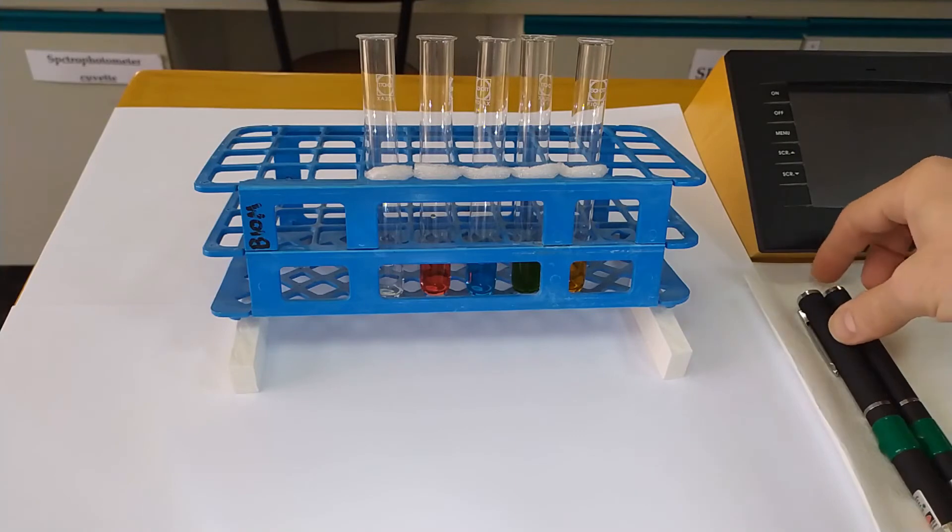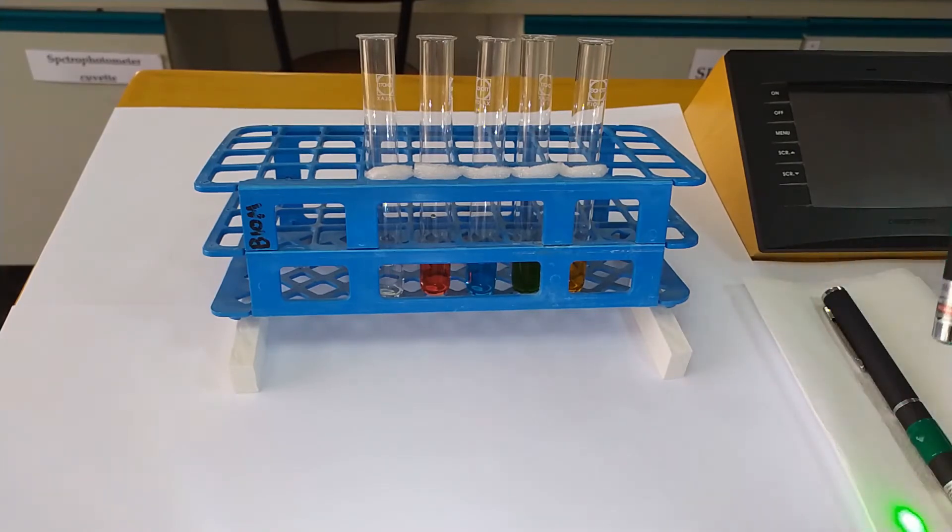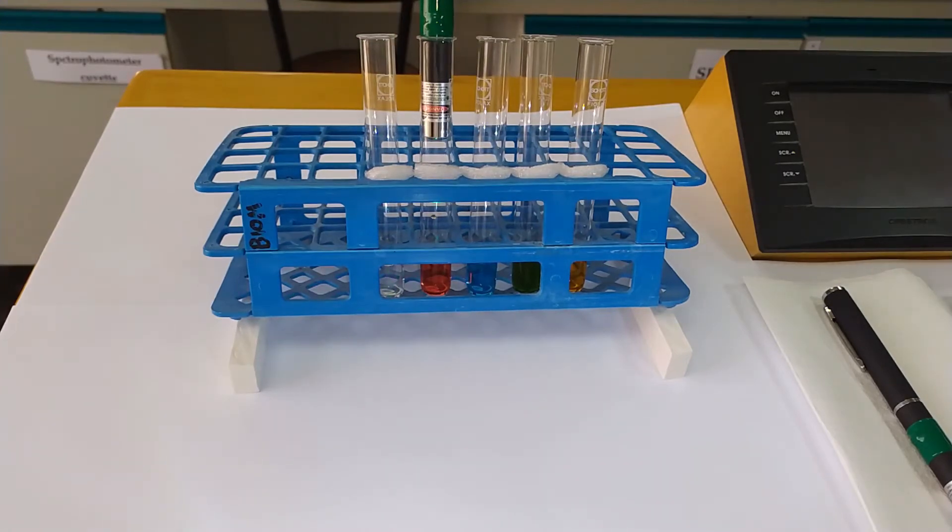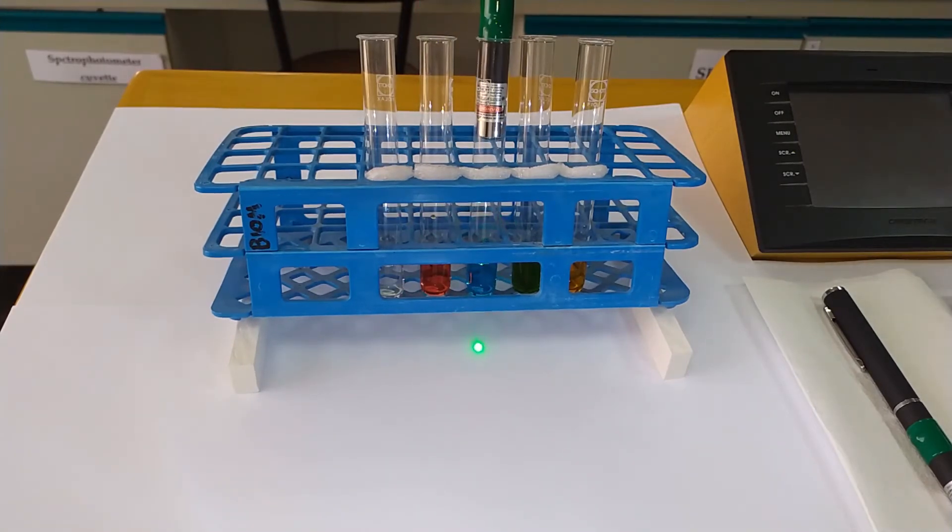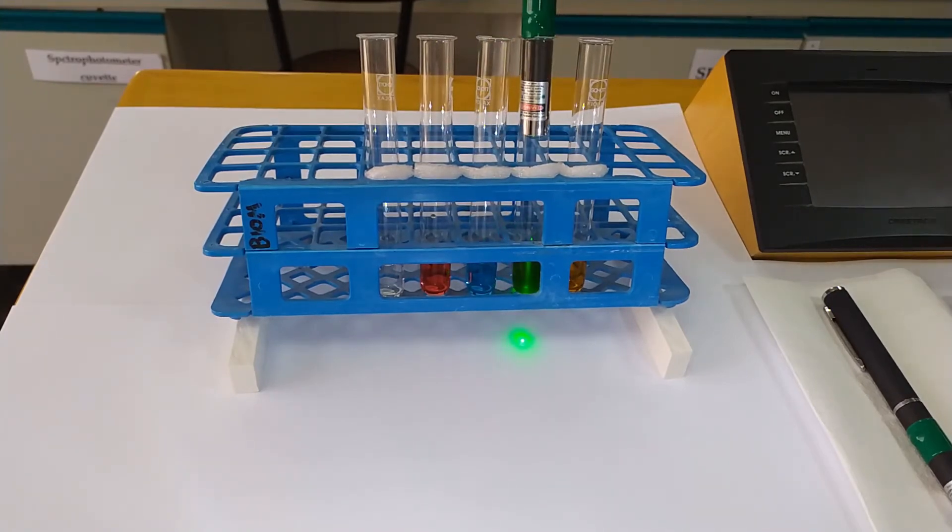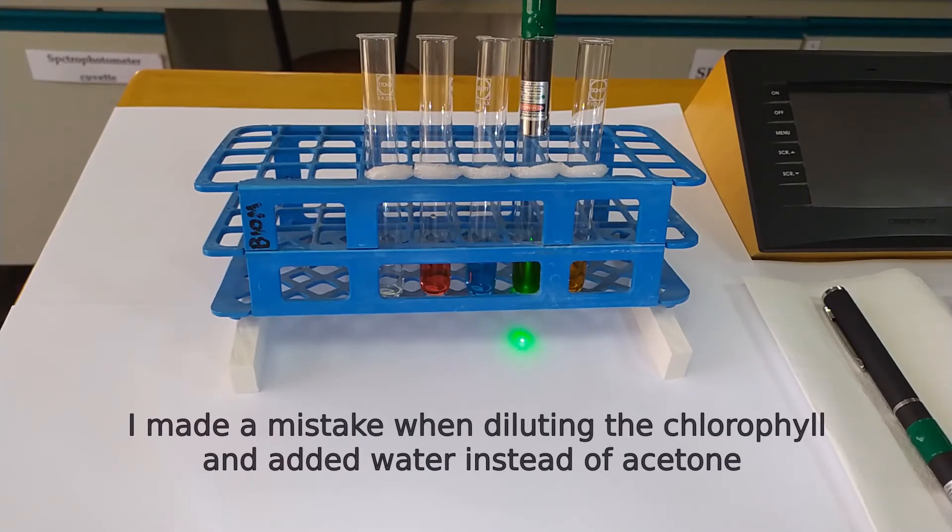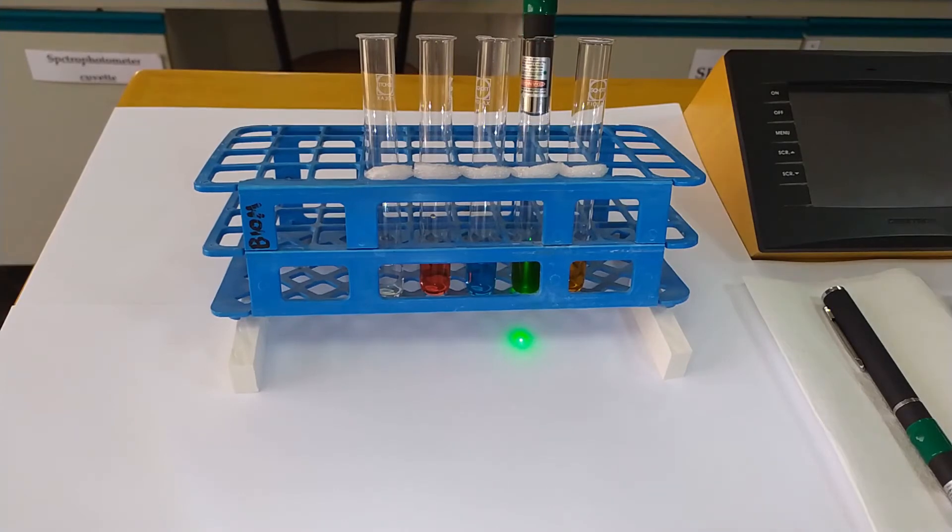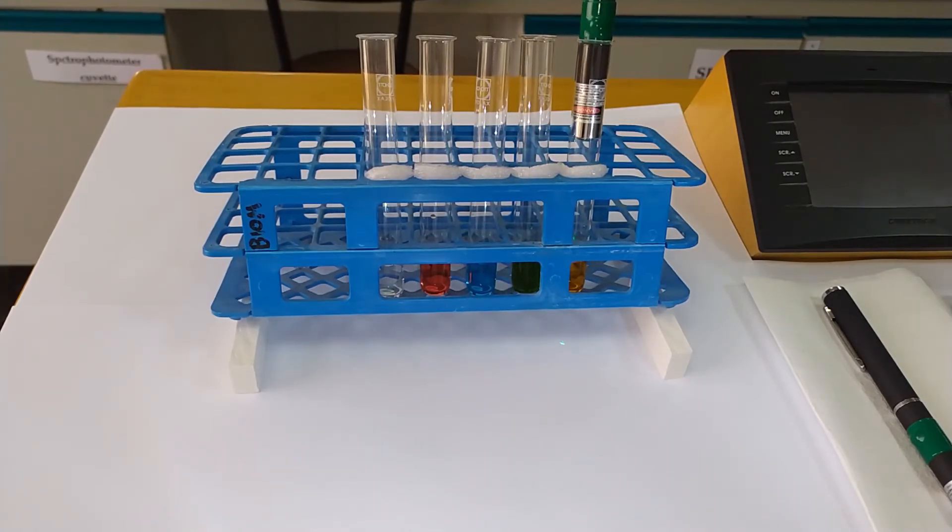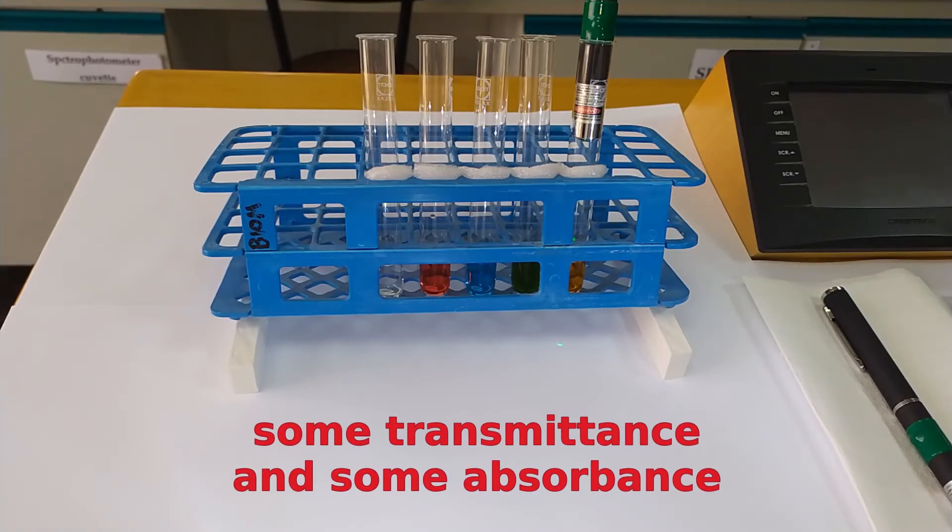Now let's try the same thing with the green light. First, the water. The light passes through without any problems. Now the red pigment. Hmm, no transmittance here. It passes through the blue solution. And the green. Now it's a bit more hazy here because the solvent is not just pure water, so it's scattering the light a little bit. And the orange solution. Some light is allowed to pass through, but it does absorb some as well.